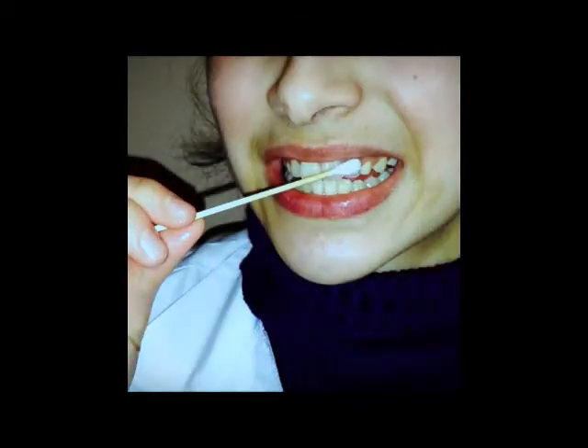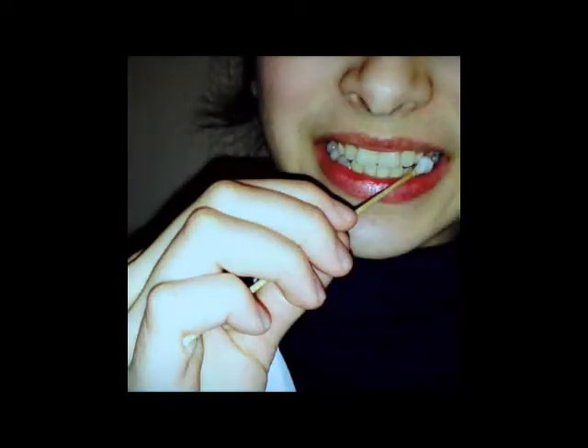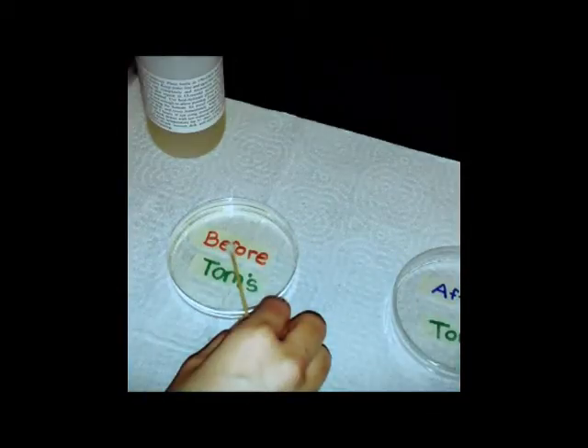Then rinse your mouth three times for five seconds. Get your petri dishes out of the refrigerator and leave it until it becomes room temperature. Then get your swab, make it damp by dipping it in sterilized water, and rub it in your front and back teeth for approximately 10 seconds.